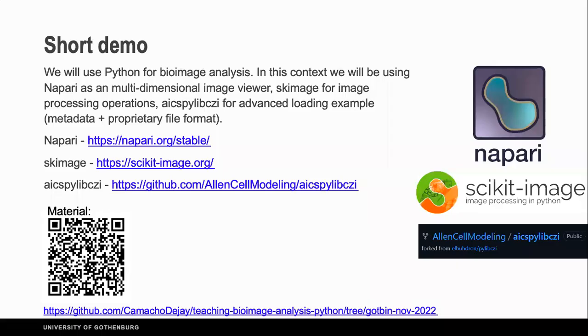We're going to go into the short demo. My idea today is to show a little bit how we actually do it in practice, and also to point people to a few websites and a few packages that would be your starting point. If you know these packages, you can start playing immediately. After that, it's a matter of exploring which packages are more applicable to your particular application or question. First of all, it's going to be Napari, which is the image viewer that I'm going to use. The other one is scikit-image, which is the one for the processing steps, like filtering and segmentation and so forth.